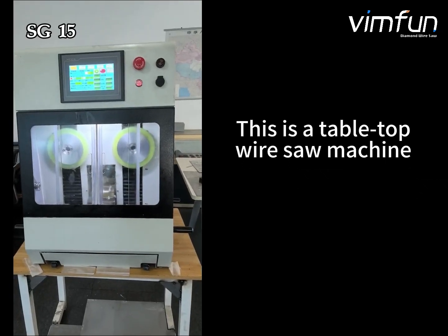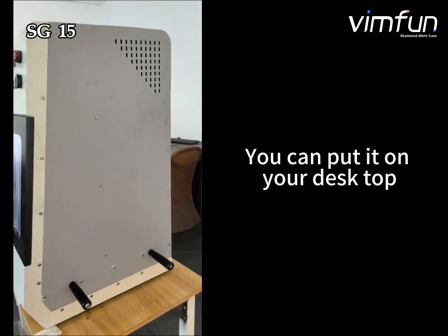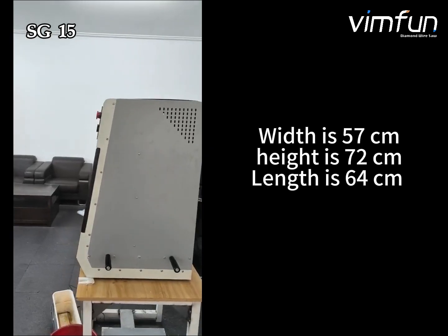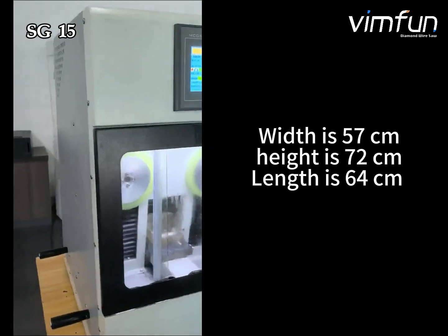This is a tabletop wire sawing machine. You can put it on top of your desk. Width is 57 cm, height is 70 cm, and length is 60 cm.